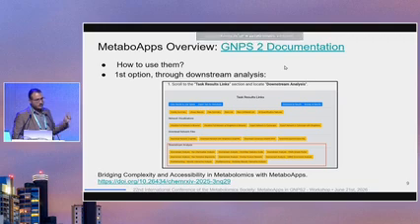And then, when you have that done, one of the things is to work on the network.